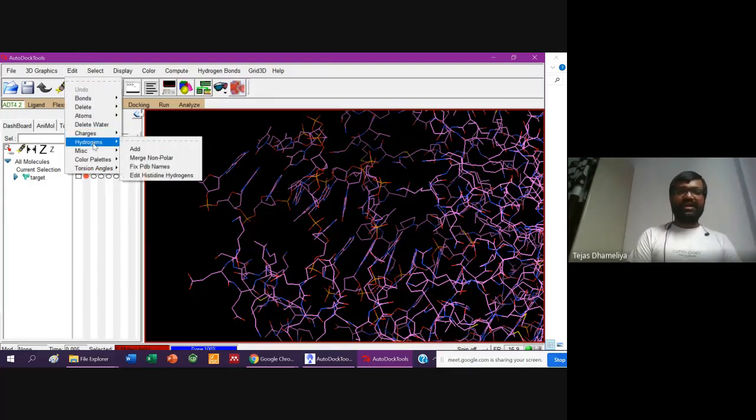Then we need to add the hydrogens. So I will go to edit, hydrogens, and click add. Why do we need to add hydrogens? There is a reason.